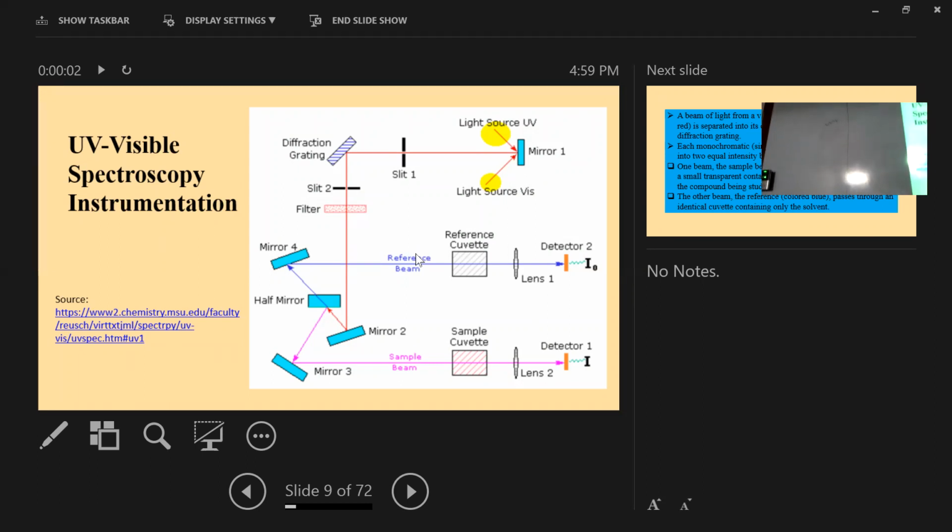If we have cells of different length, one very thin and another a little bit thicker, let us consider this is around 1 centimeter, that means 10 millimeter, and another one is around 5 millimeter.